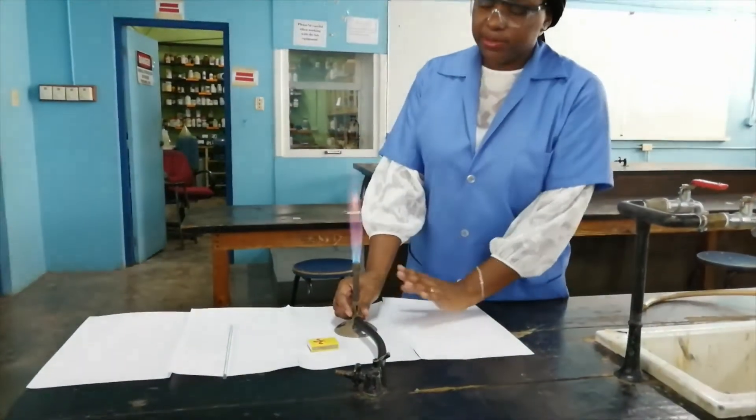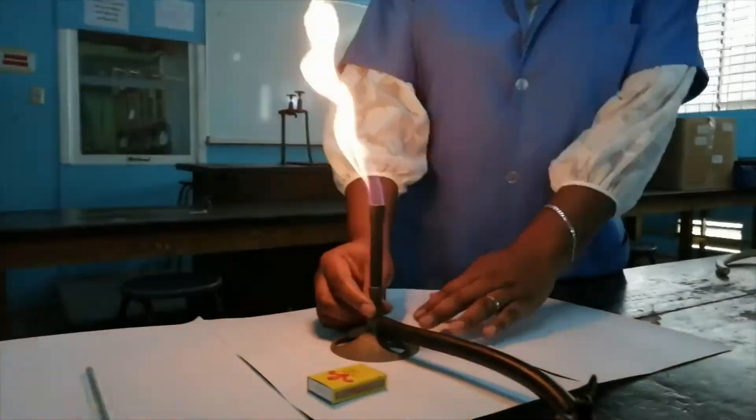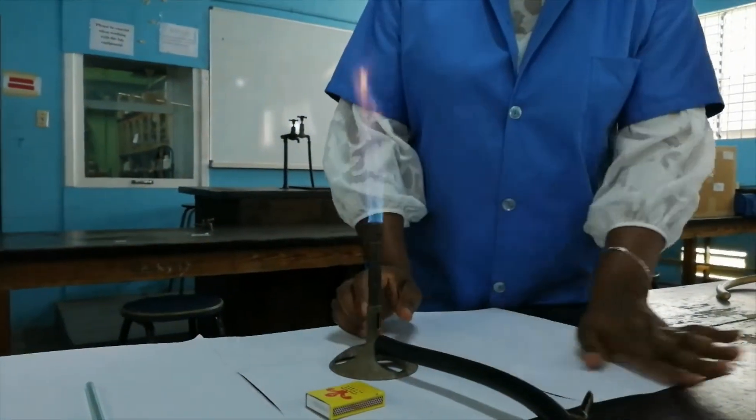So I am now opening the air hole. You will see that the flame changed color. Before it was not getting enough oxygen so it was orange. Now it is getting oxygen — it is now blue.